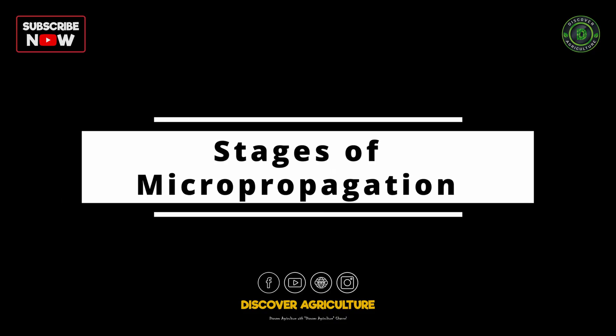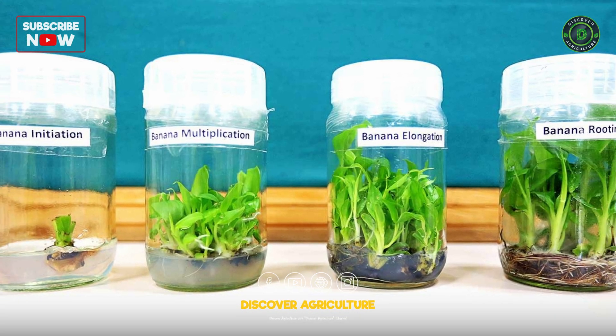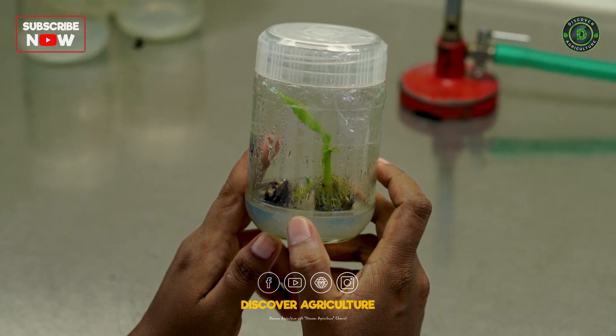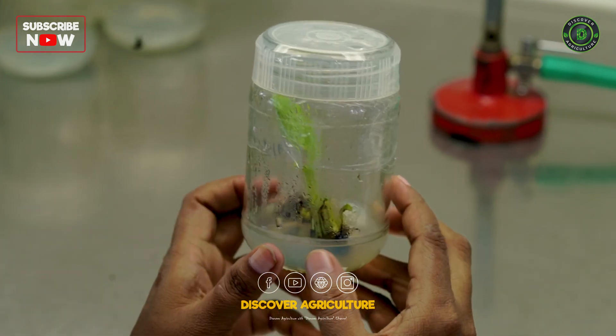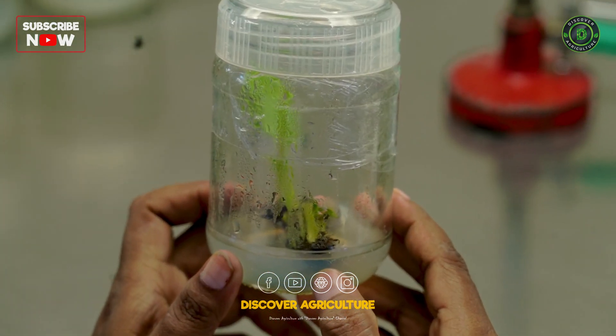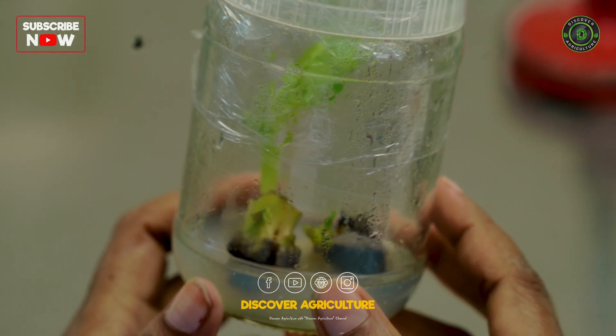Stages of micropropagation. The micropropagation process consists of 4 main stages. Stage 1: Collection and Inoculation. The shoot apical meristem is inoculated into the nutrient media. This is the initiation stage, where the culture starts its growth journey.